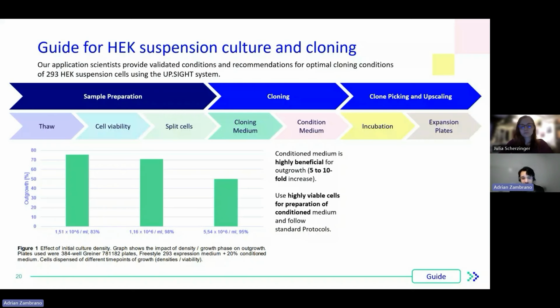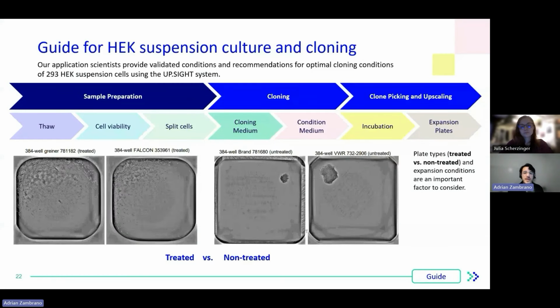Again, you could optimize potentially for different components, but in this case, we looked into conditioned media. Another key aspect of success, I would say, was not to disturb the cells in the first few days after dispensing into the plates. So basically just leave your plates in the incubator, don't touch them for about 7 days. That also increases viability and cell recovery.